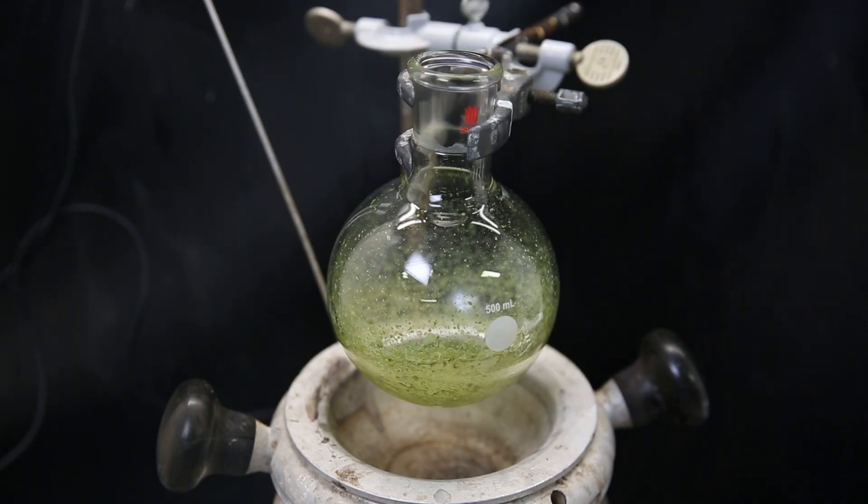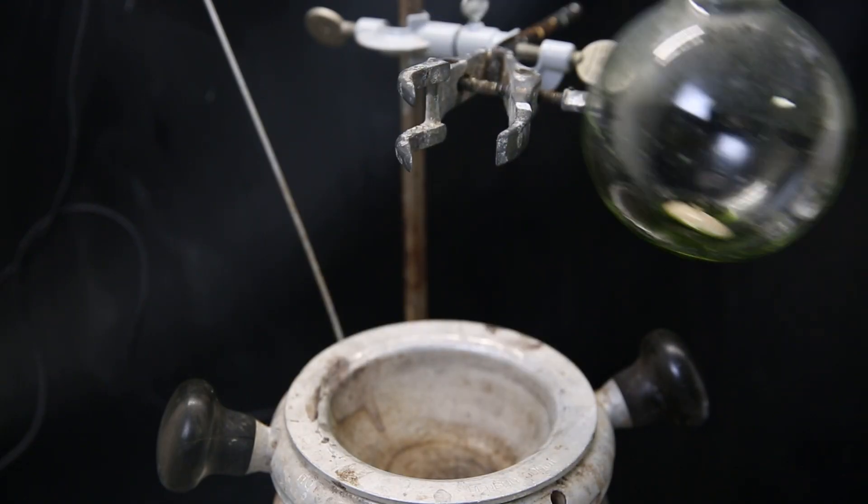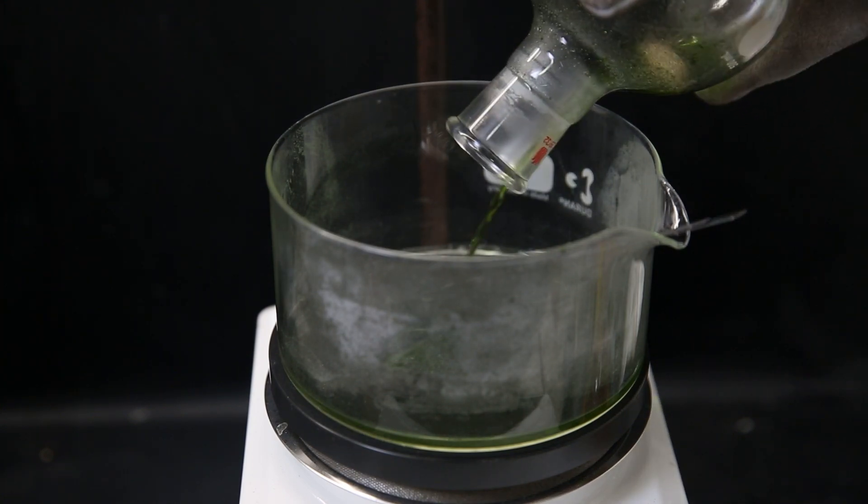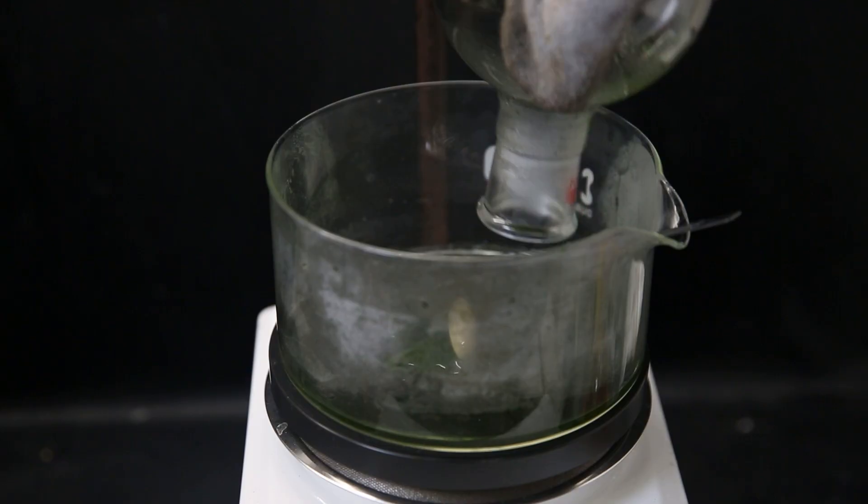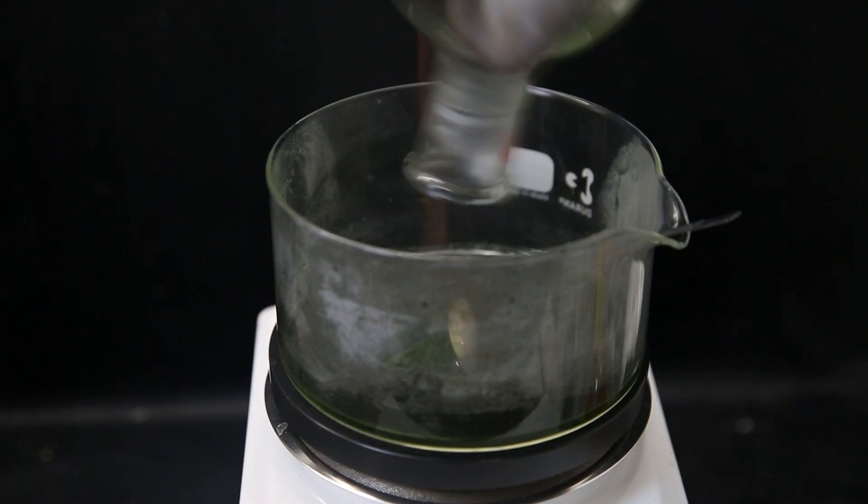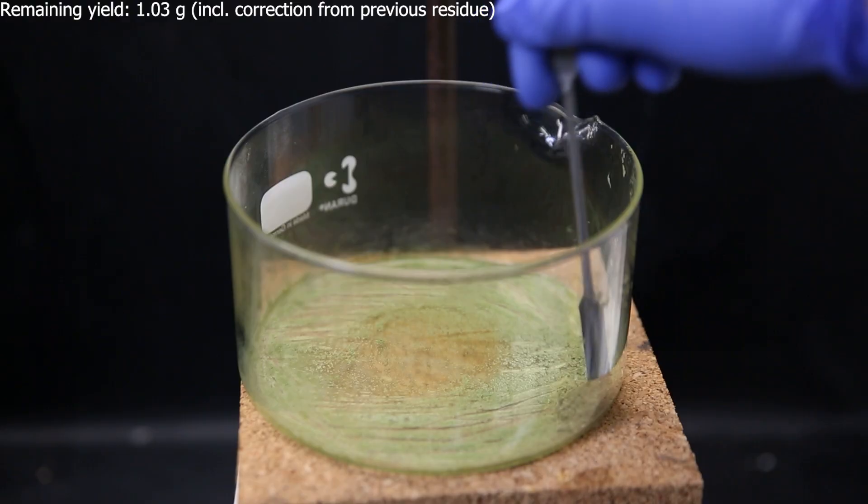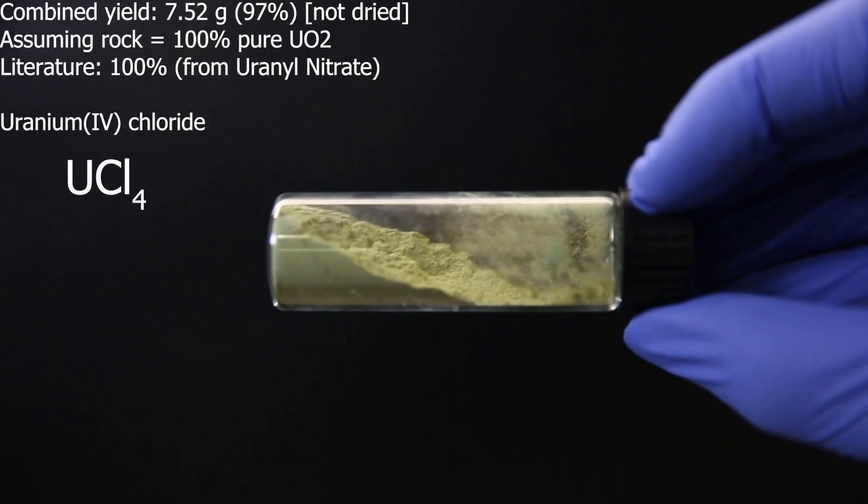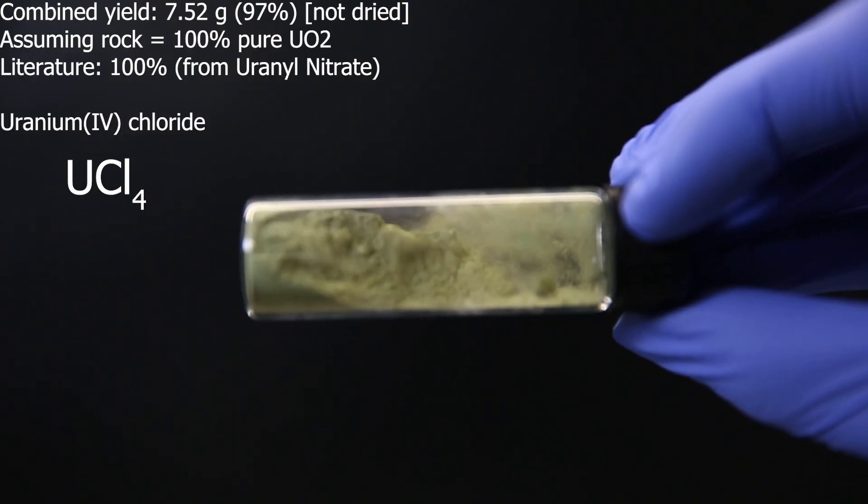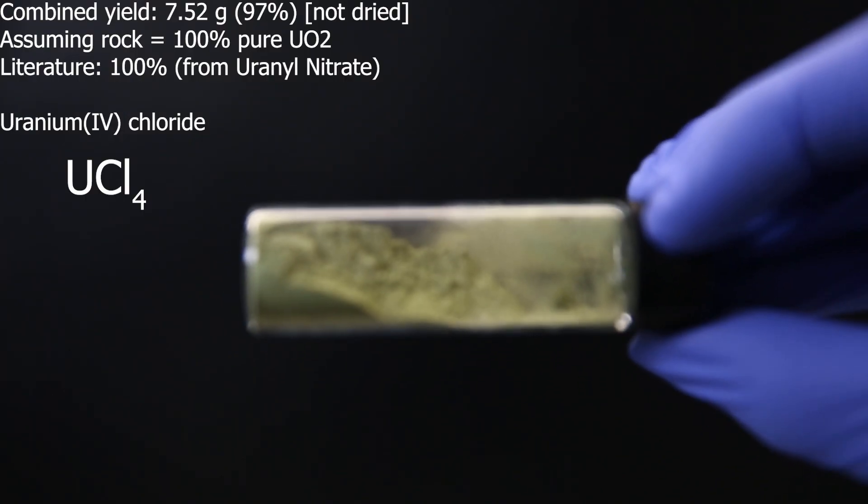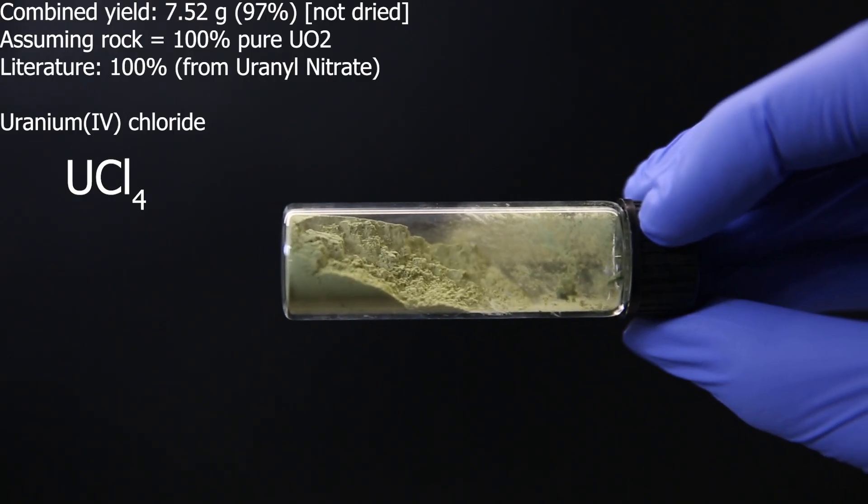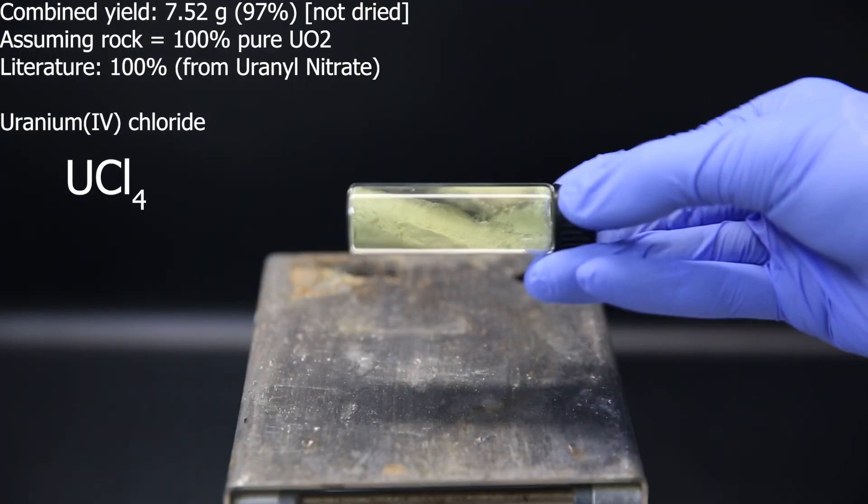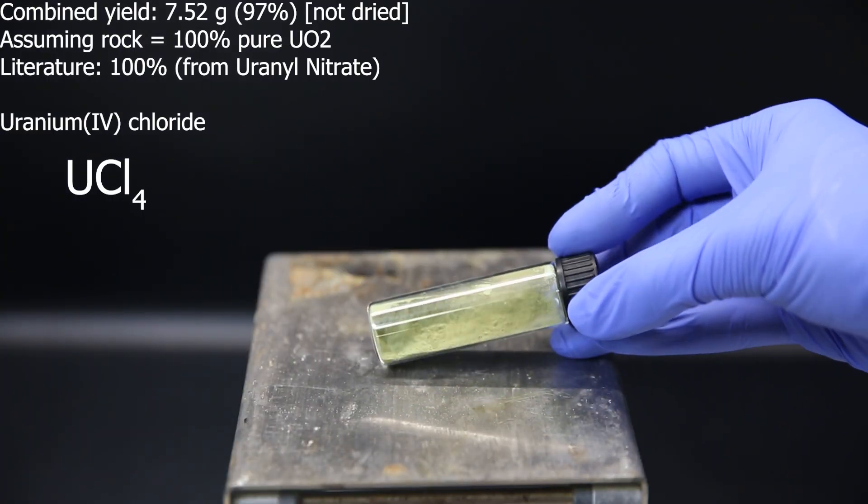When that is done, I see there's still quite a bit in there, but I can't get it out normally like this. So I re-dissolve it in a bit of concentrated hydrochloric acid. I then transfer it all to a crystallizing dish in which I set the residue of the other uranium tetrachloride, to which I also added some hydrochloric acid to dissolve it. And after evaporating all of the acid off, I am left with the remaining uranium tetrachloride, which turned out to be 1.03 grams. I transferred the solid to a vial and the combined yield without drying turned out to be 97%, assuming the rock was 100% pure uranium dioxide.